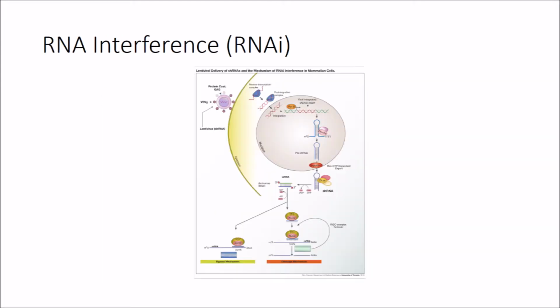To suppress the E2 ubiquitin-conjugating enzyme coding genes, I used a process called RNA interference, or RNAi. RNAi uses double-stranded RNA, which is then introduced into an organism where it is used to create a protein that destroys the target mRNA, suppressing the gene.